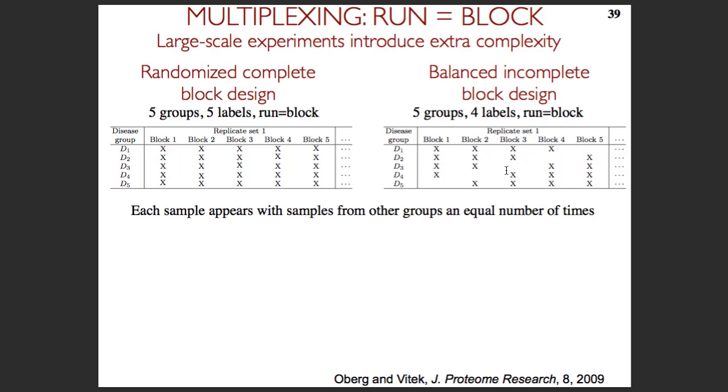Oh, so this is chemical labeling, and you would need to talk to someone who does these experiments. Maybe somebody can comment. So these are essentially chemical labeling of the samples as opposed to metabolic labeling in SILAC. And these labels introduce a shift not at the MS1 ions, but in the fragment ions that you could see. So I'll let maybe experimentalists comment on that more.